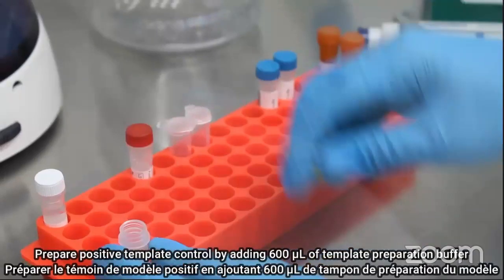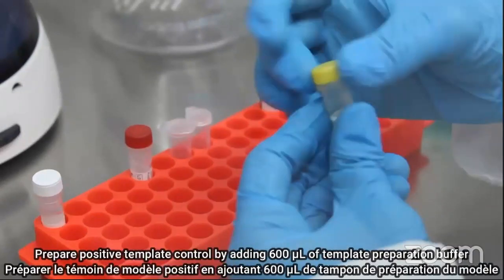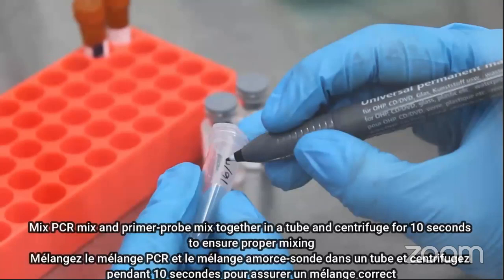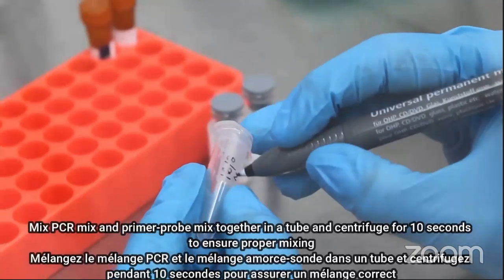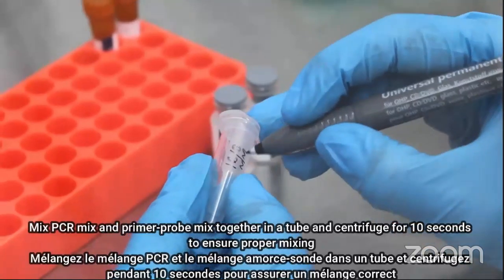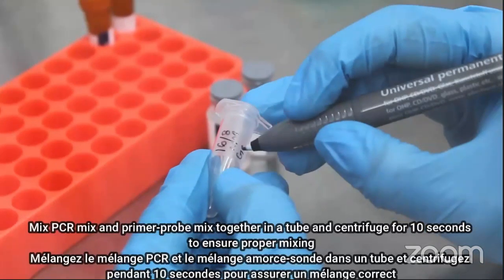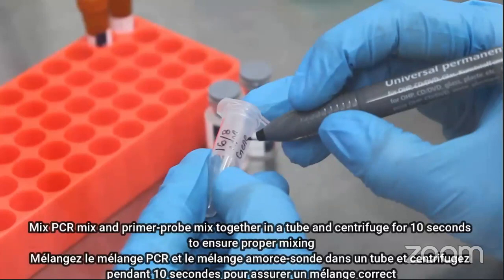You don't have to resuspend the negative control because it's already RNase, DNase free. Now to prepare the master mix, just label a tube with the date and master mix initial, and then you can also label it with the kit name as well.